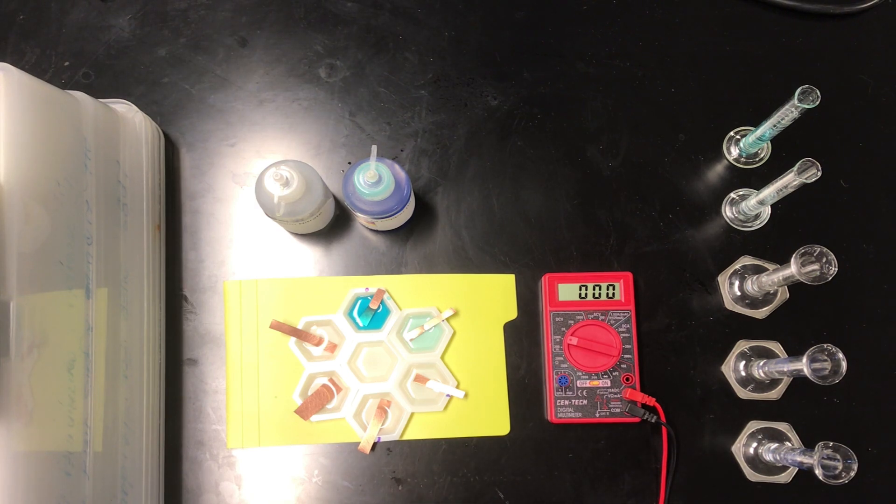Hello everyone. In this experiment we're going to investigate the properties of concentration cells, which are a type of galvanic cell in which the components of the cathode and anode are identical but they're present in different concentrations. I've gone ahead and set up a series of half cells in this honeycomb apparatus you see here, and let me talk a little bit about how this was set up.